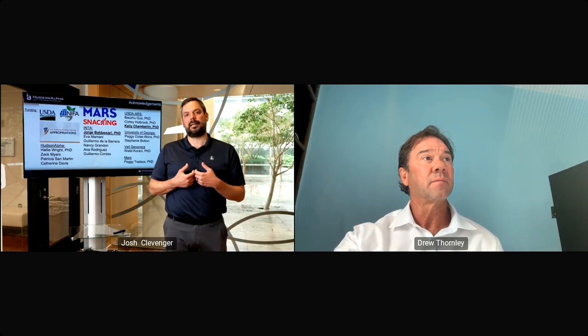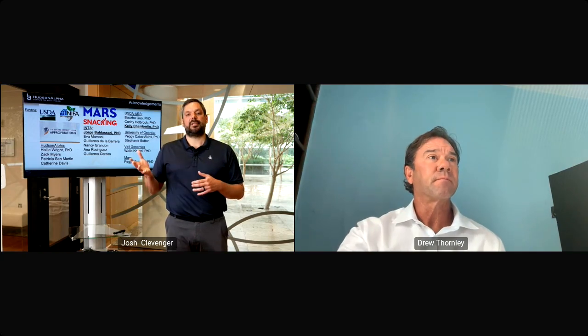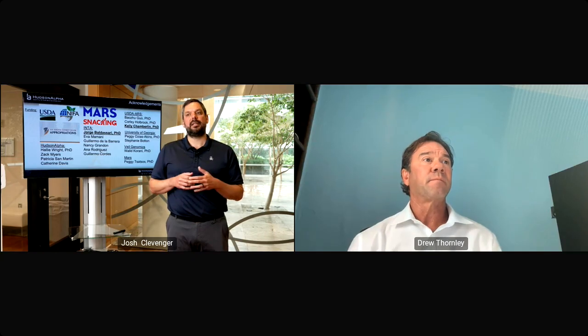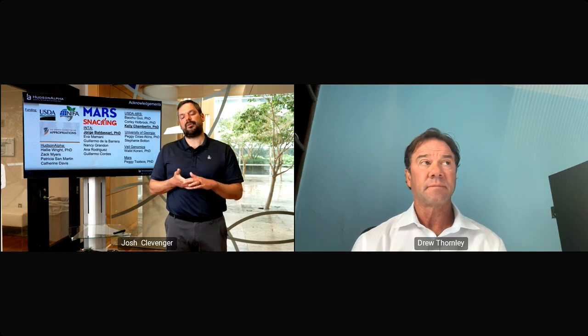In my own personal work, we always sequence the whole population. But for some folks, in fact, there's a really great watermelon group at University of Georgia that we work with a lot. What they do is they just send us the bulks and individuals. So we just do one plate for them, and then we do the bulking in silico and do the mapping that way. So there's a lot more power involved. But yes, you're right. It's skim-seq on each individual, and then those are bulked together on the computer.